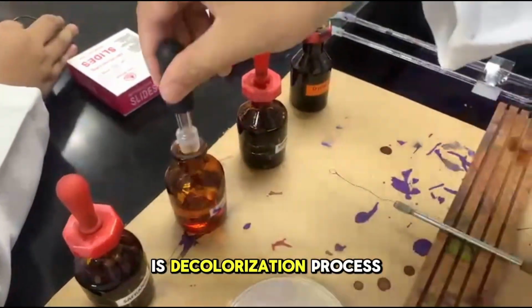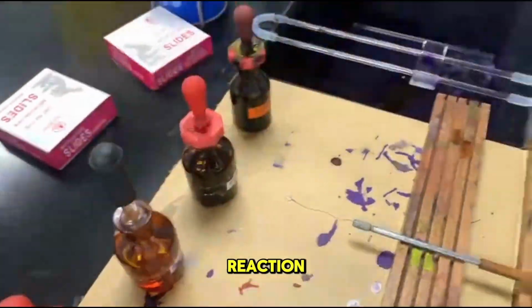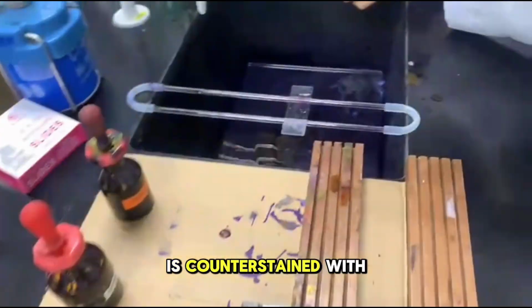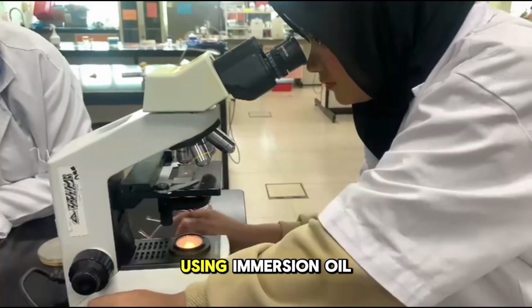The next step is the decolorization process using alcohol. After decolorization, the slide is rinsed immediately with water to stop the reaction. Finally, the slide is counterstained with safranin for about 1 minute. The slide is then washed, dried, and observed under a microscope using immersion oil.